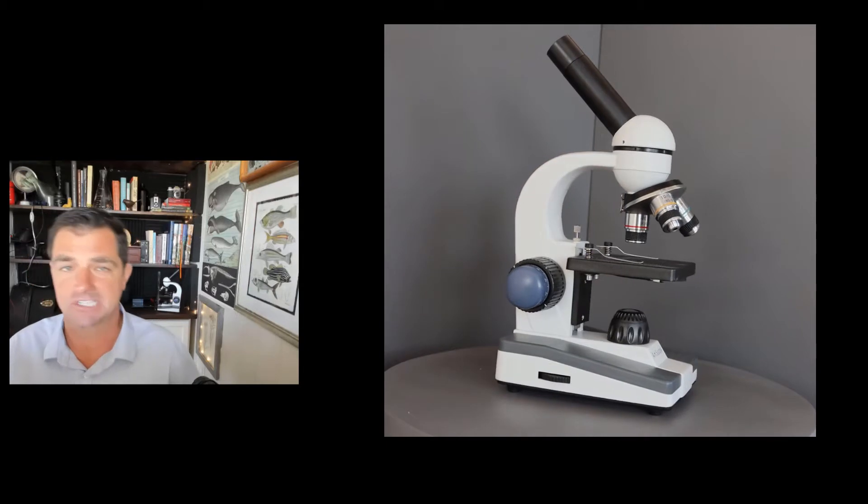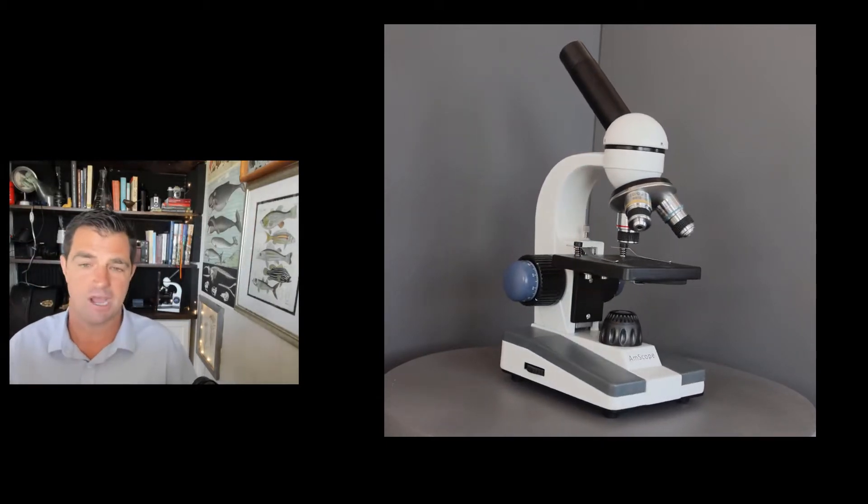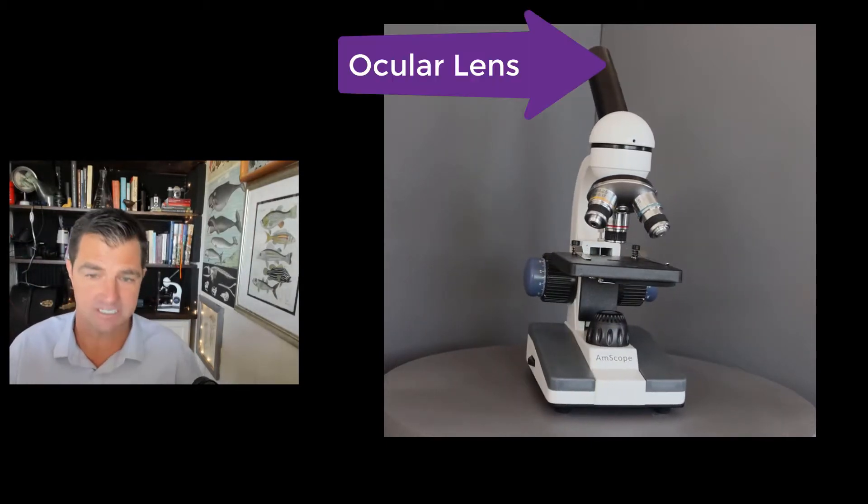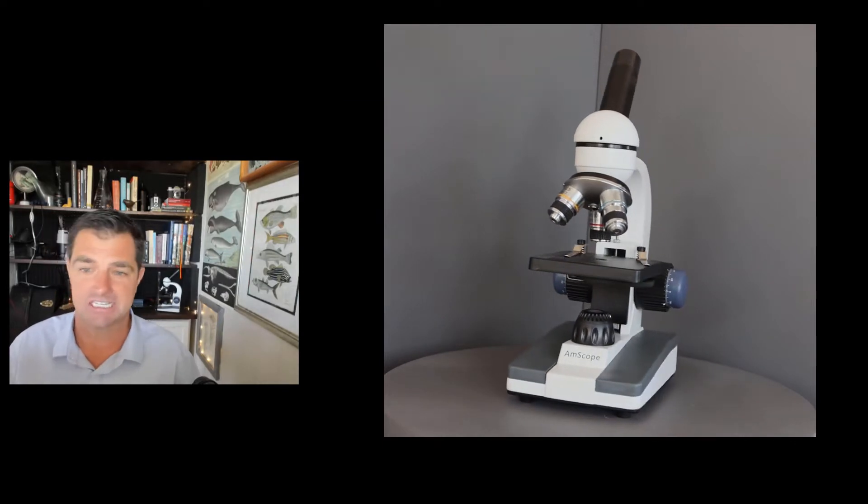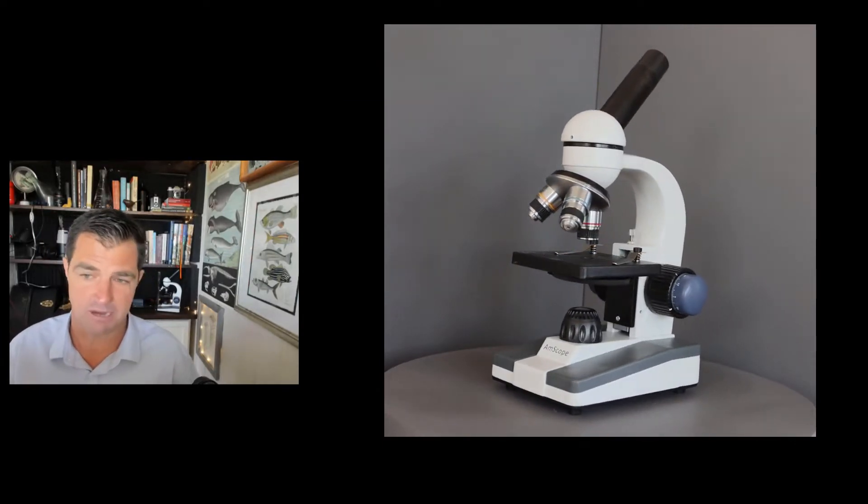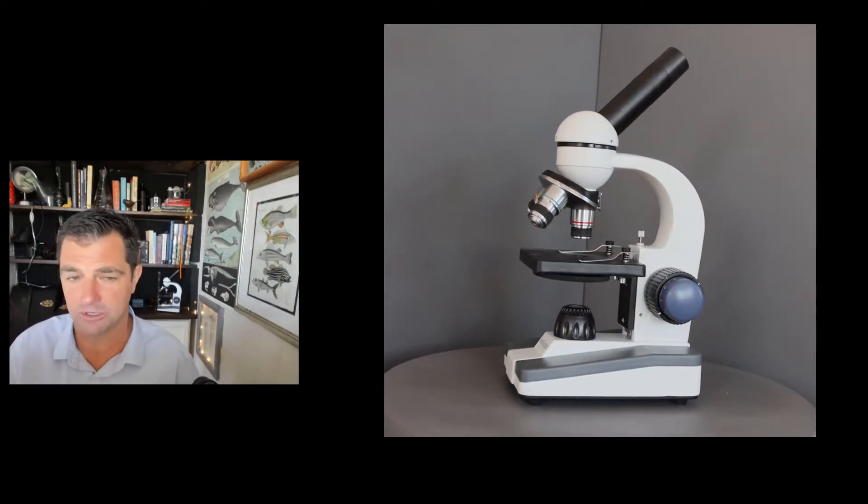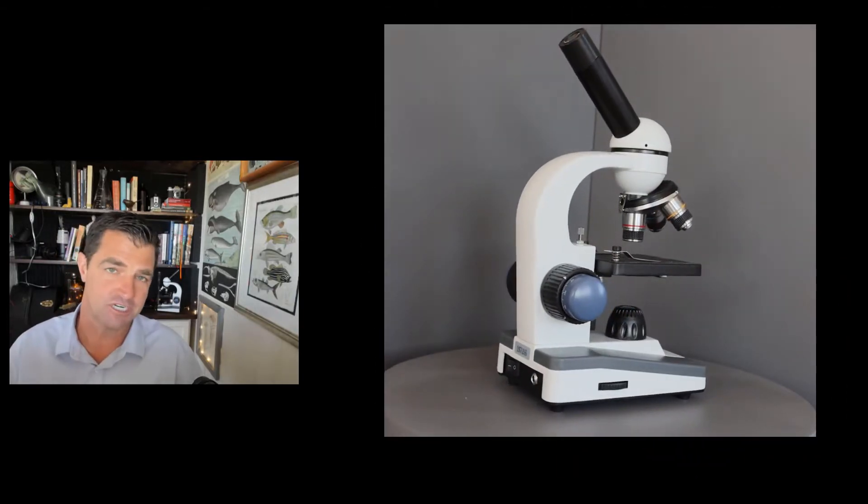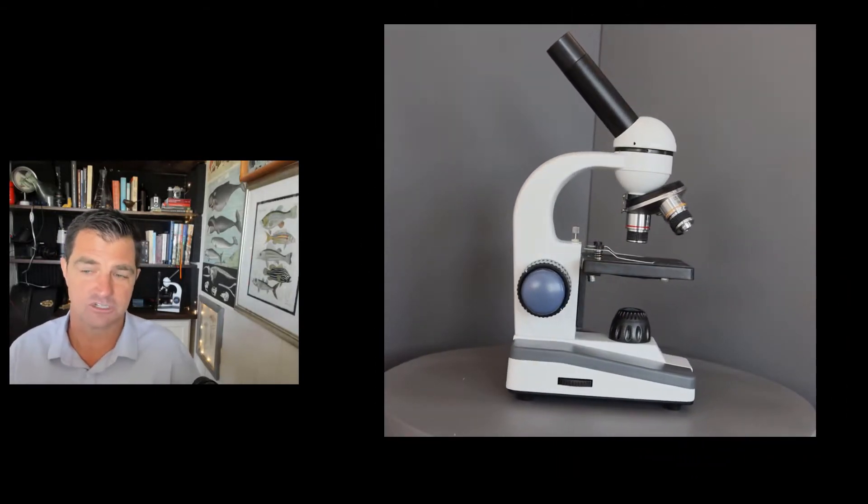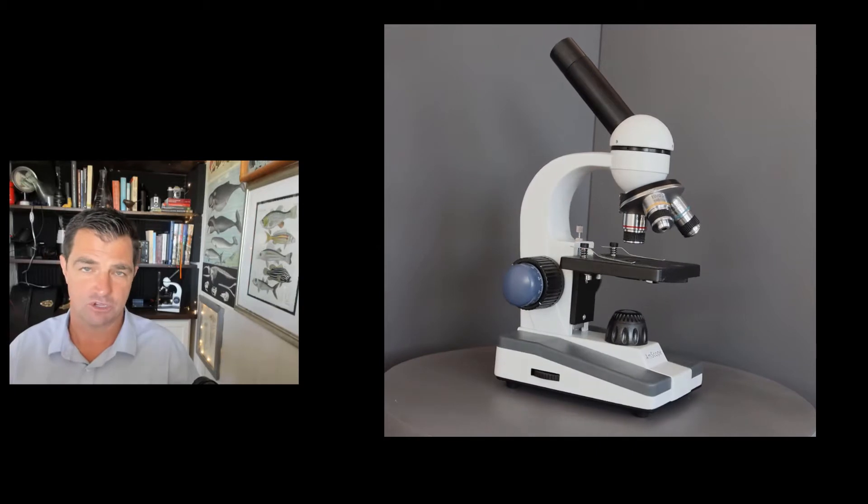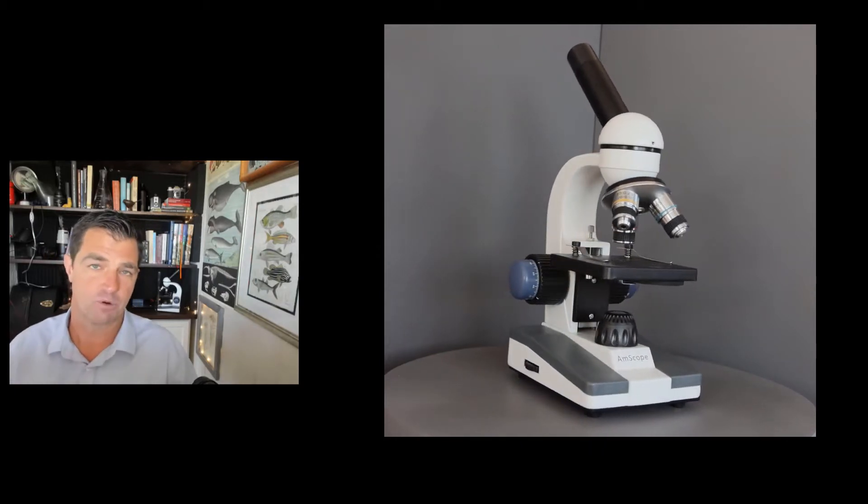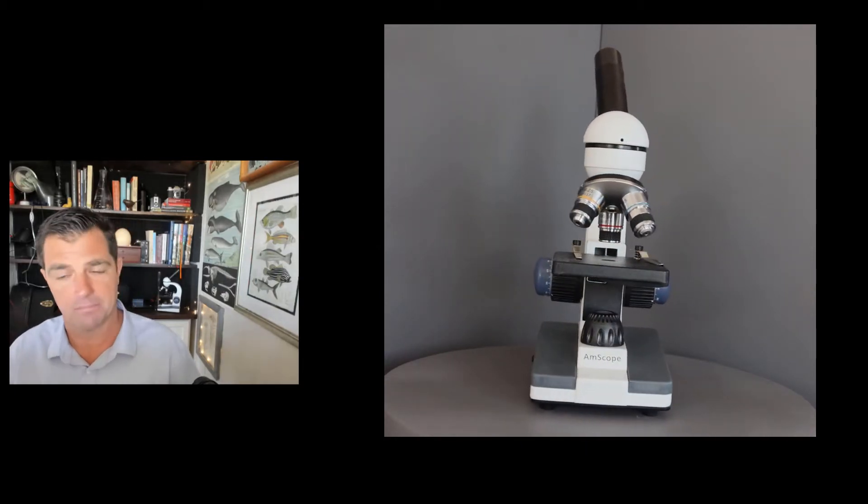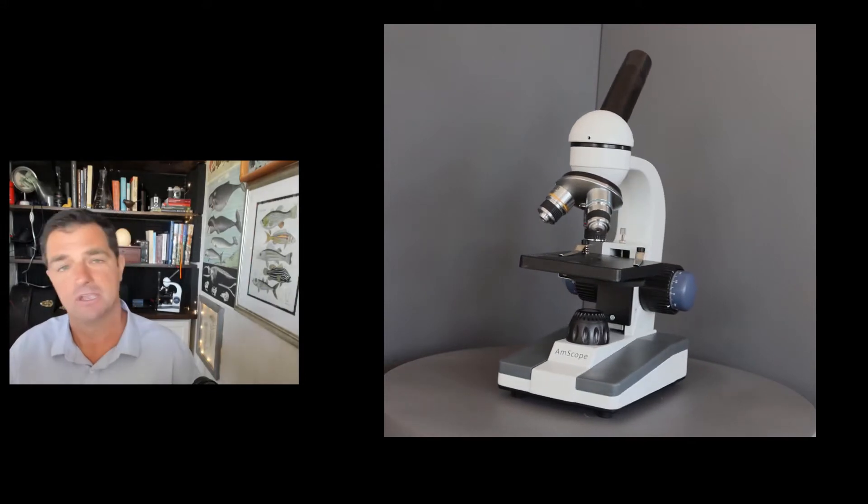So first, let's cover the basic parts of the microscope. First, we have the ocular lenses. In this case, this is the part you're going to look through. In this version, the M150, there's only one eyepiece that you look through at a time, so therefore we call it a monocular compound light microscope.